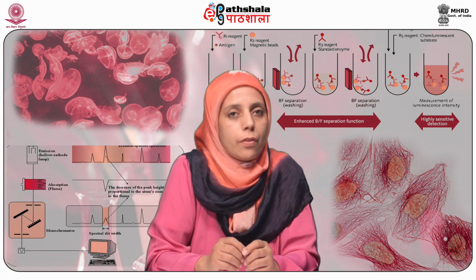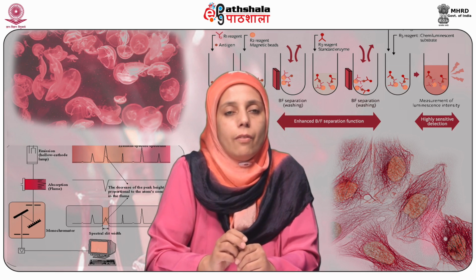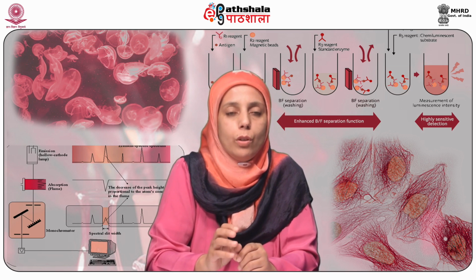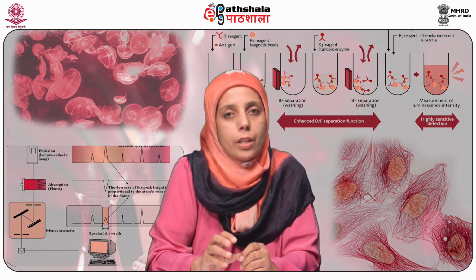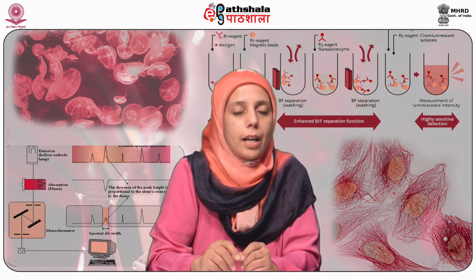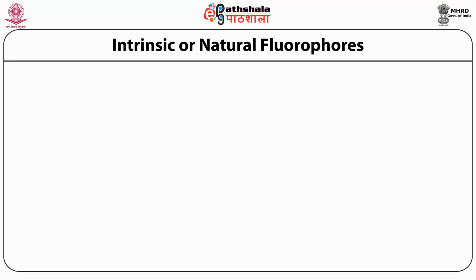In the case of intrinsic fluorescence, it occurs naturally, like in aromatic amino acids, NADH, chlorophyll, green fluorescent proteins, or flavins. Whereas in the case of extrinsic fluorophores, you can attach a fluorophore, an organic small molecule, to any molecule, and due to that, fluorescence is generated, and you can study the spectral properties of the sample. For example, fluorescein is attached, or dansyl chloride is attached, or rhodamine can be used to induce fluorescence in non-fluorescent substances.